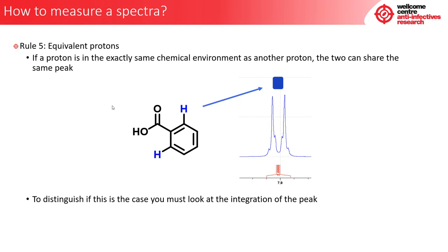because there are some compounds out there that have areas in them that are symmetrical. They have identical regions, and the NMR can actually detect these identical regions. It might not be able to distinguish the differences between both of them, but it can tell you that it's present in the sample. So let's look again at benzoic acid.